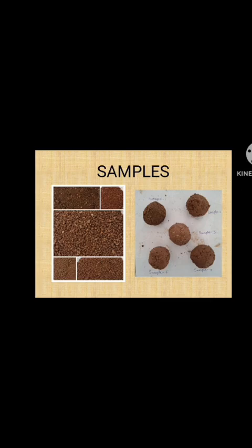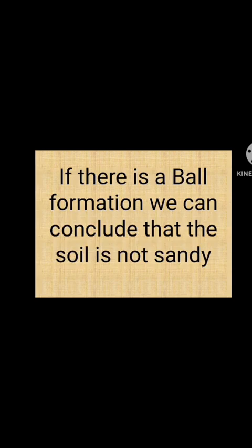Here 5 soil samples are collected from 5 different locations, and each soil sample is molded into a mud ball. If there is a ball formation, we can conclude that the soil is not sandy.